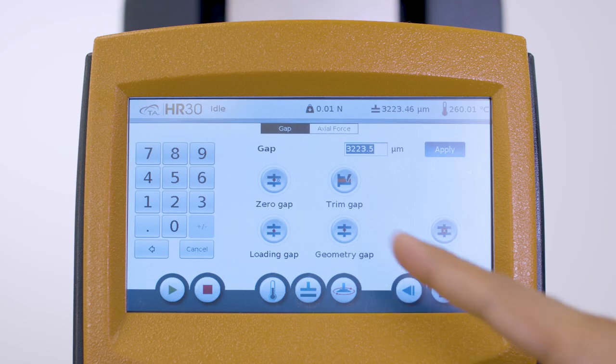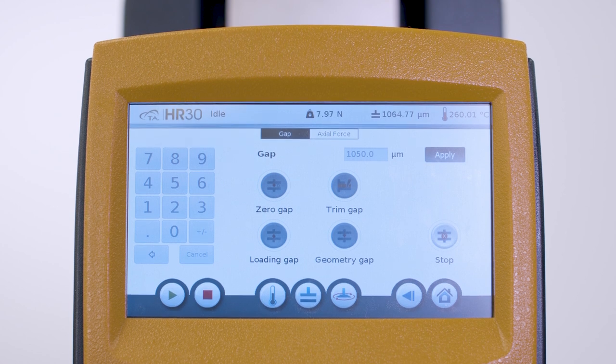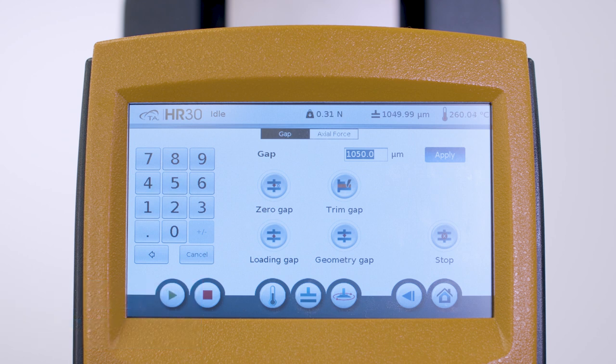Use the instrument touchscreen to send the geometry to the trim gap, which is typically five percent above the measurement gap. For example, if your measurement gap is one millimeter, then you set the trim gap to be at 1.05 millimeters. Allow the sample to equilibrate and relax at the test temperature. You can use the axial force readings on the touchscreen to monitor the sample relaxation.